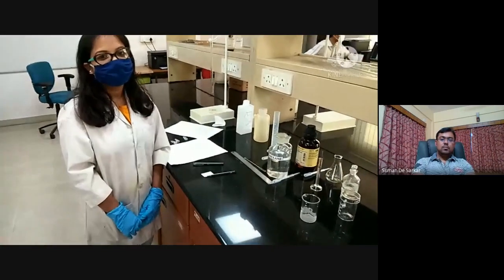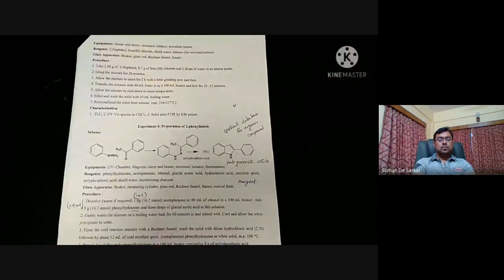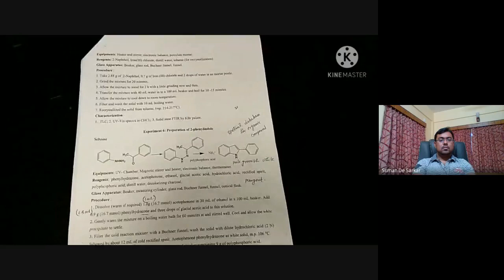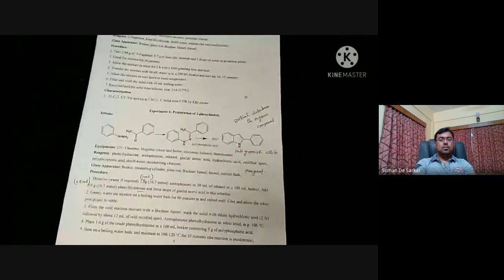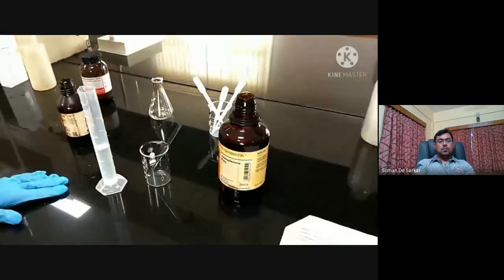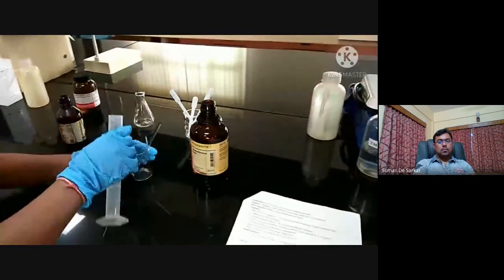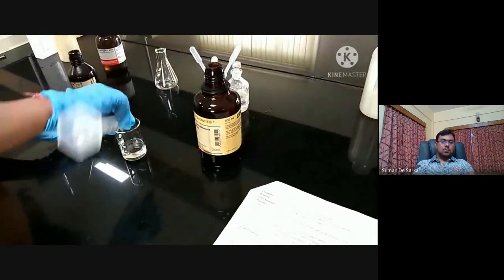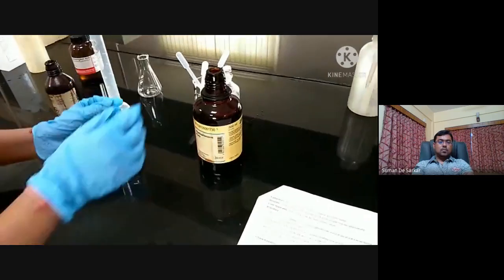Okay, let's proceed. As instructed, we're going to do the synthesis of indole today, and it is a two-step process. First step is the preparation of hydrazone, and afterwards the rearrangement to make the indole. For the first step, we need acetophenone and phenyl hydrazine, and we are now going to add ethanol, the solvent here. 30 milliliters of ethanol we have taken.